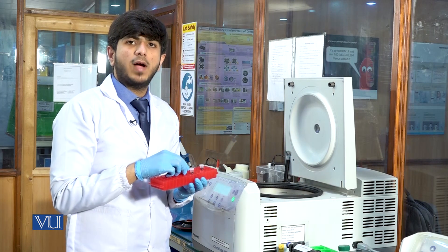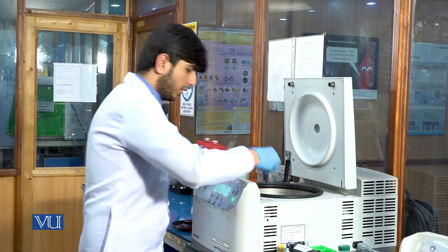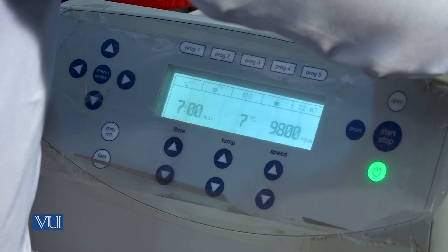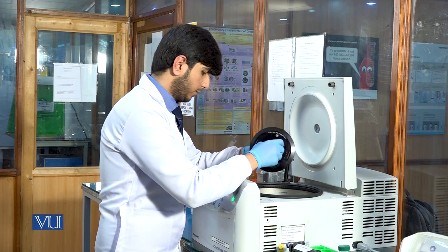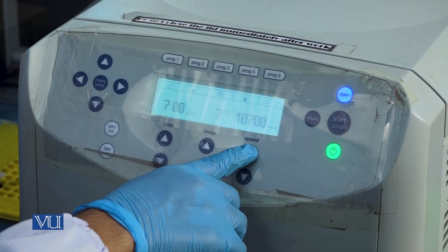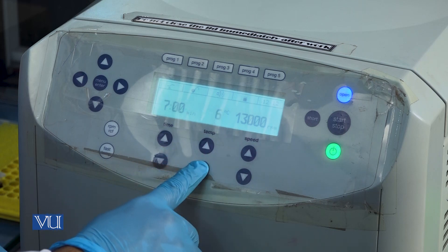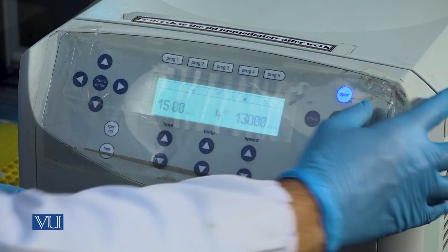It should be remembered that while keeping the samples in the centrifuge machine, the centrifuge machine should be balanced from each side. Centrifugation will be done at 13,000 RPM for 15 minutes at 4 degrees Celsius. We will set the centrifuge machine at these settings and start.